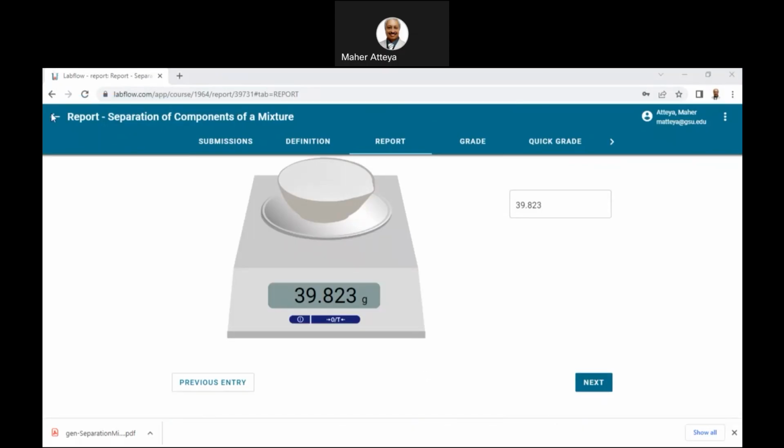So click next. Just copy the arrow here. Copy the arrow, come here to the next part, then paste. Take this arrow all the way there. Click next.